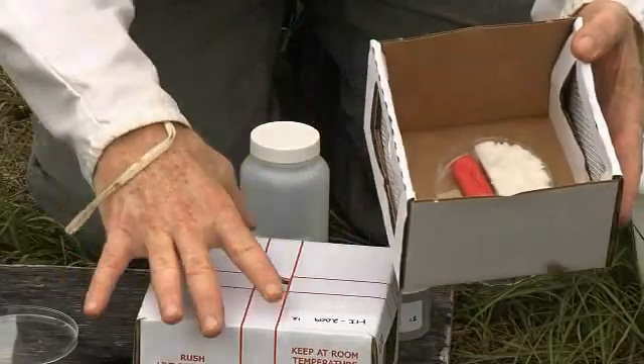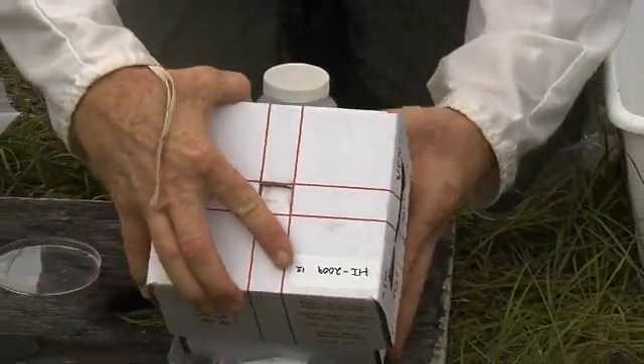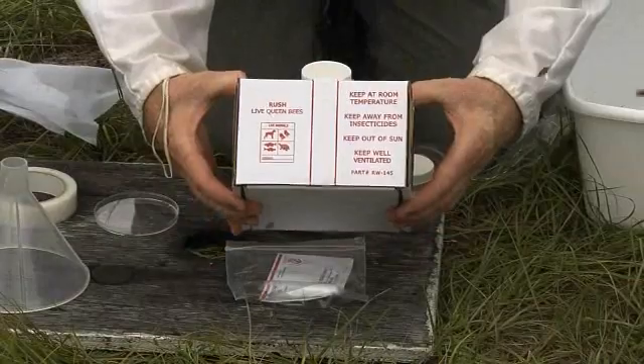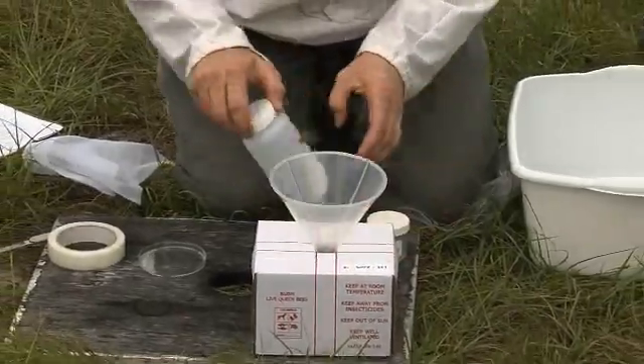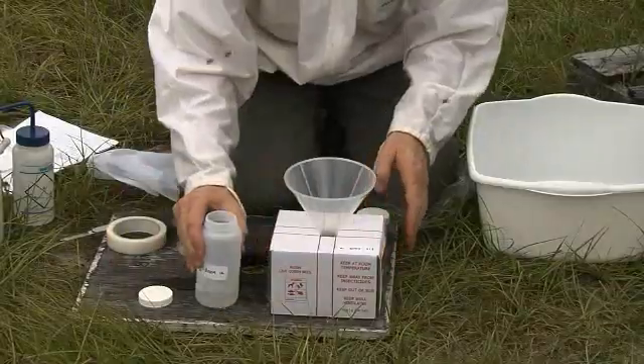Now close the shipping box. This can be a little tricky, so be sure to compress the sides of the bottom of the box to enable the top to slide completely down. Be sure the top is flush with the bottom of the box so no bees are able to escape. Now place the funnel into the hole on the top of the box. Finally, open the large alcohol bottle so it can receive bees.